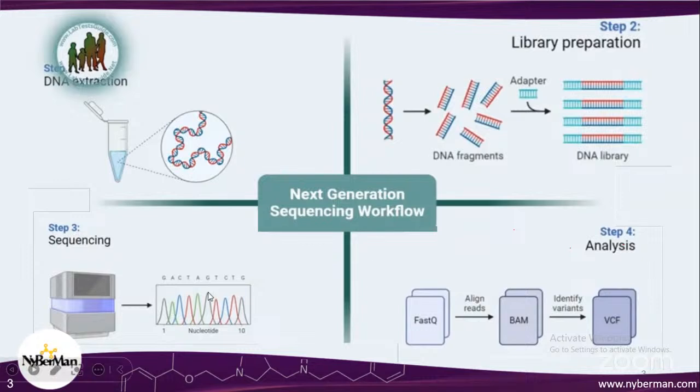Once we have the sequencing results, we will have the files in different formats. We actually have the BCL format that comes directly from sequencers, which is converted into FASTQ format, and then stored in different databases respective to each disease, if there is a disease specific database. Otherwise they can be in any open repository, that is, primary or secondary repositories like NCBI, ArrayExpress and other repositories. Once we have the FASTQ files, we can further proceed to analysis of this type of data.